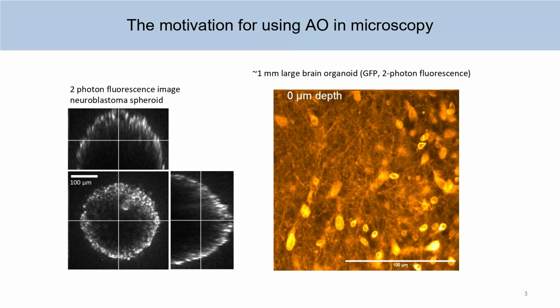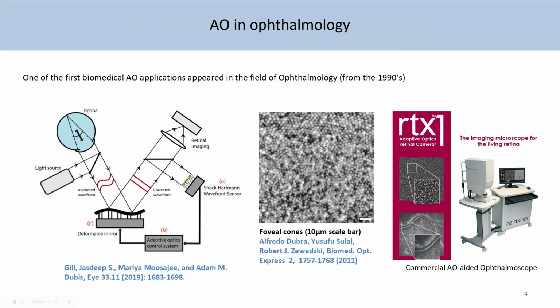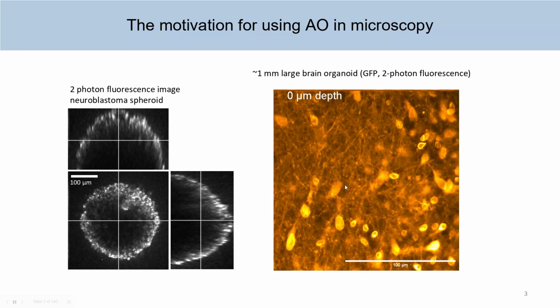Now in astronomy that was put into practice in the 90s, but of course in biological imaging we don't have an atmosphere we have to look through, but we have to look into samples, and that becomes more and more important actually. So this should be a slideshow here. I don't know, it doesn't work. Never mind. But the left works, right?